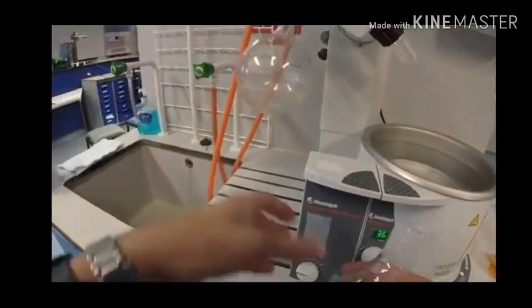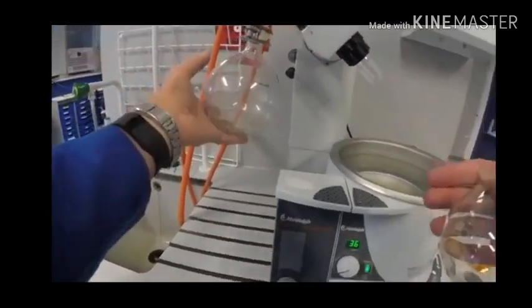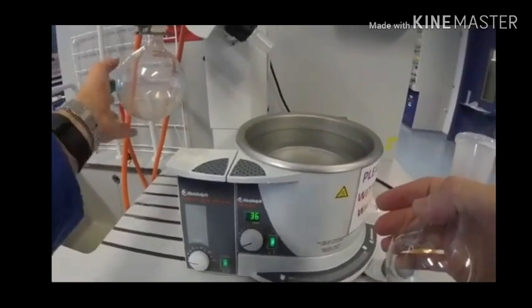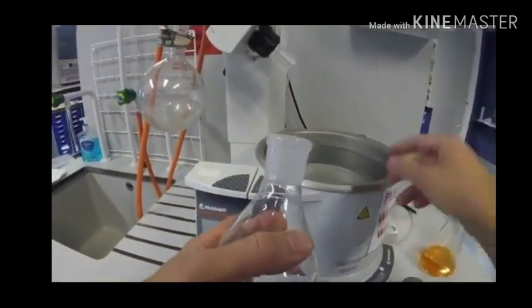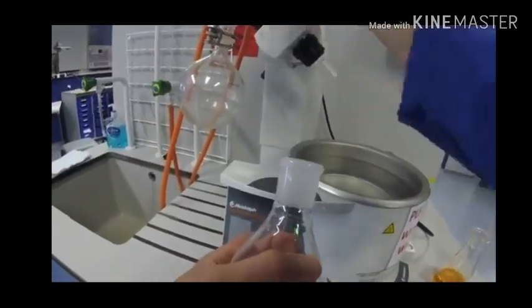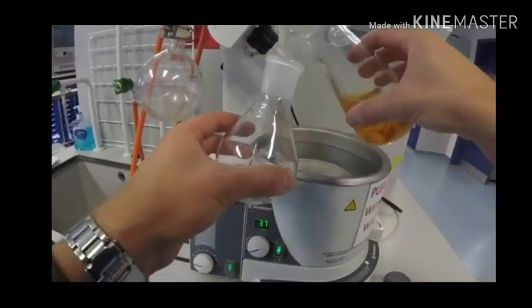You do want to make sure that the receiver flask is empty. It should have been emptied by the last person, but just check that, because the last thing you want is, if your compound accidentally bumps and is pulled up over into this flask, to be contaminated with anything anyone else has been using.